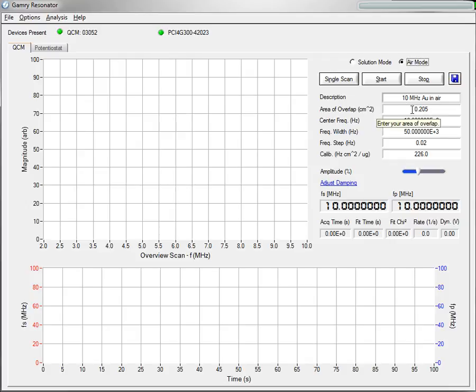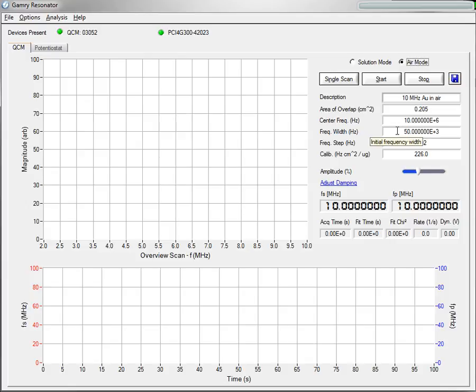What I have mounted here is a 10 MHz gold crystal in air. I have the default center frequency of 10 MHz, a frequency width of 50 kHz, and a frequency step of 0.02 Hz.